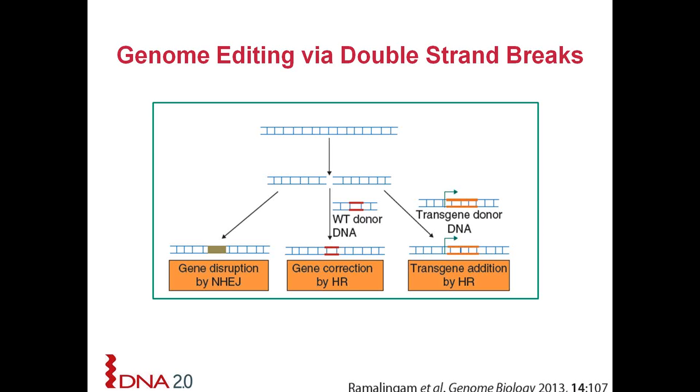Great. When using CRISPR in other organisms, such as Saccharomyces, Pichia, algae, etc., what promoters do you use to drive the gRNA expression? With Saccharomyces cerevisiae, which is what I've been working with most, we've been using SNR52, the snoRNA promoters. They've been published about in the DiCarlo paper from the Church Lab. That's the one I've been using. There are certainly other promoters out there that one can use for these as well.